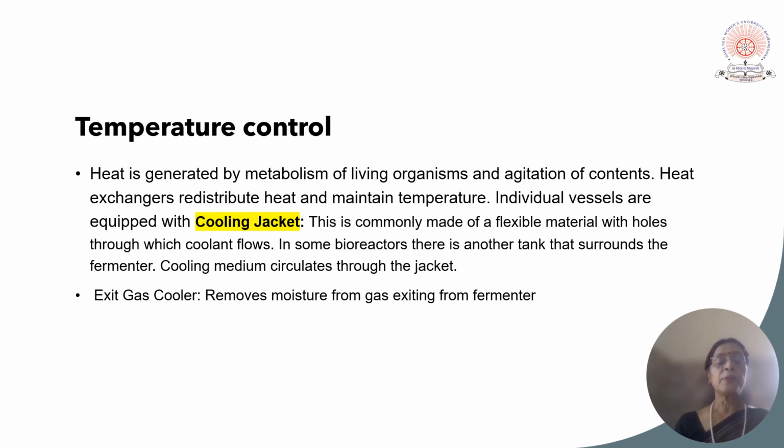Temperature control is very important because inside the bioreactor, the conditions must be maintained at optimum. The temperature, pH, and the concentration of substrate must be maintained properly. Heat is generated during the microbial activity and also due to mechanical agitation. There are different types of heat exchangers that redistribute the heat and maintain the temperature.